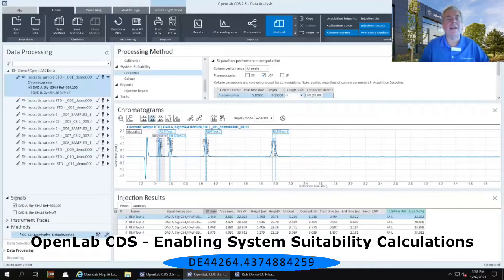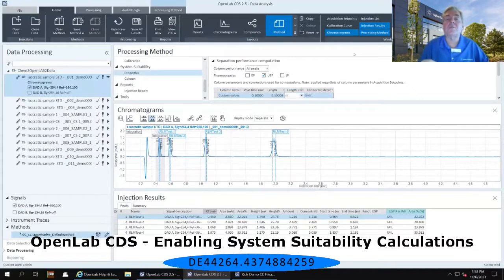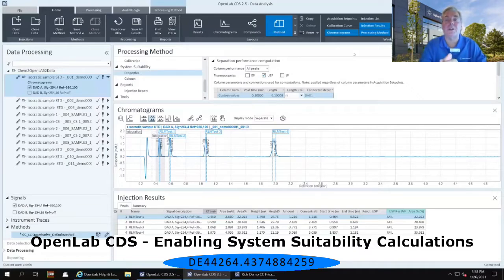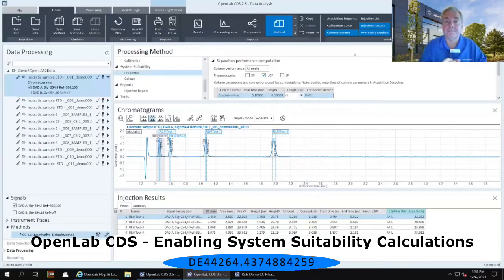How will you come up with this in your laboratory? Every single column you ever get, whether it's a GC column or an LC column, comes with a Certificate of Analysis. That Certificate of Analysis contains this information for you to fill in, and this will now be locked in and indelibly linked to this method. So that's where you get the information.